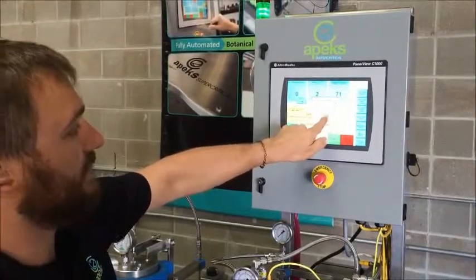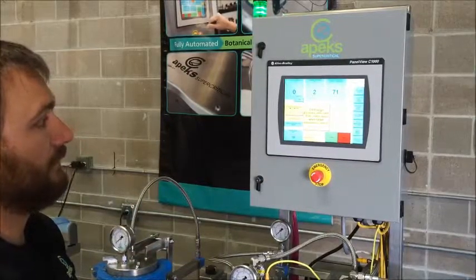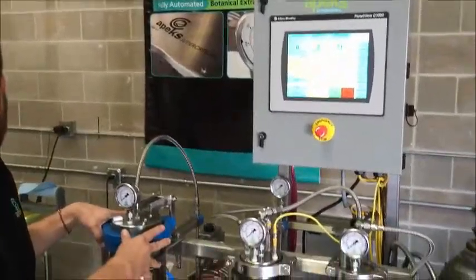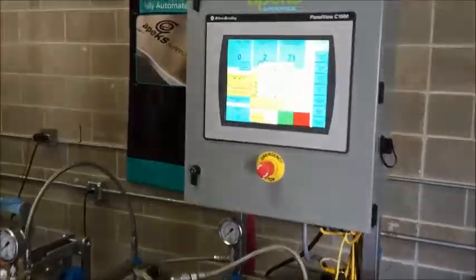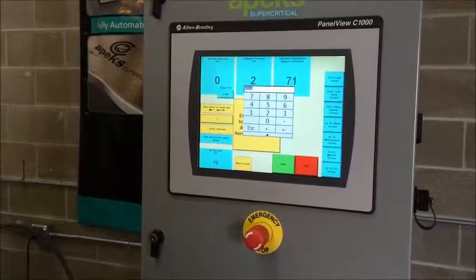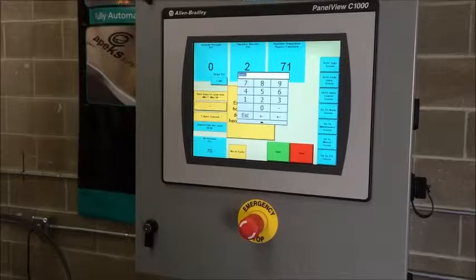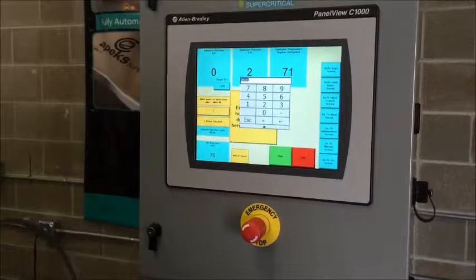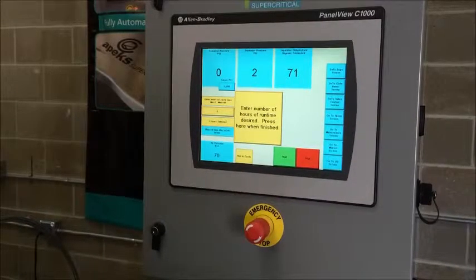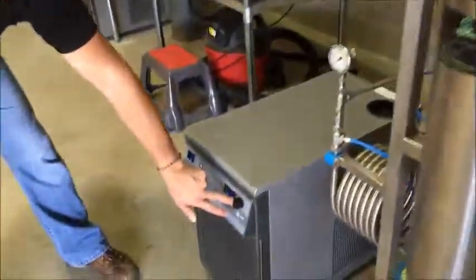Now we're going to come over here and just hit start — it walks us through everything. First, it asks us to enter our target pressure between 900 and 1,900 PSI. I've got 1,400 PSI entered; I'm going to change that down to 1,200 PSI for this run, then acknowledge. It tells us to enter the number of run hours, which is determined by how much plant material you've loaded and what pressures and temperatures you're running. At higher pressures and temperatures, these systems process about a pound per hour; at lower pressures and temperatures, about a pound every two to three hours. Since this is just a demonstration, I'll put one hour in.